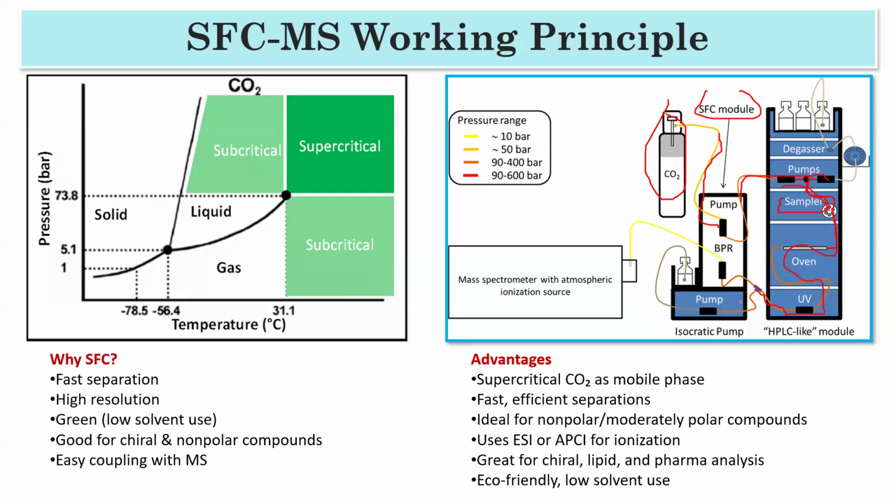And then it will go to your mass spectrometer, and in the mass spectrometer your sample will be analyzed, okay? So that is the SFC-MS. But you don't need to worry about this because it's not so famous. It's getting momentum, people are trying, but it must be very expensive also.